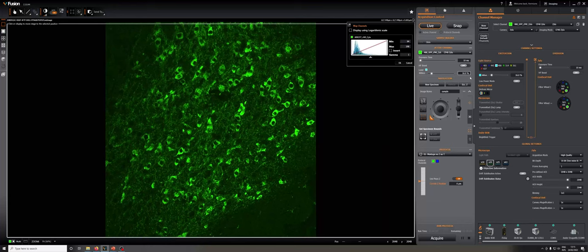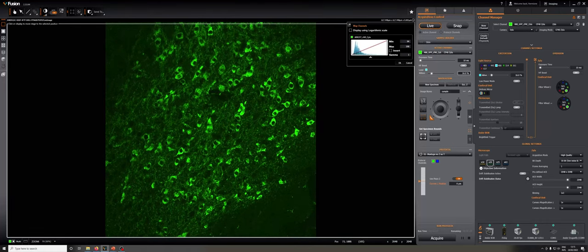Now obviously, if we go too far, we run the risk of bleaching. And how to tell? We need to run a small time lapse to actually tell. Or if it's really bad, we'll be able to see it just increase in live mode as an increase in the noise, or if we turn off the auto, as a decrease in the intensity of the image.